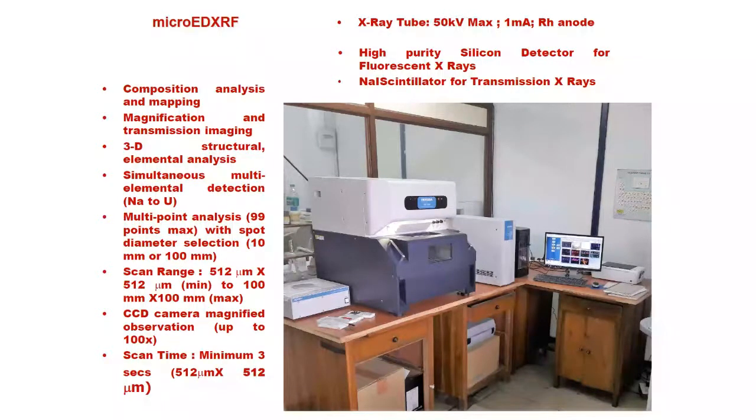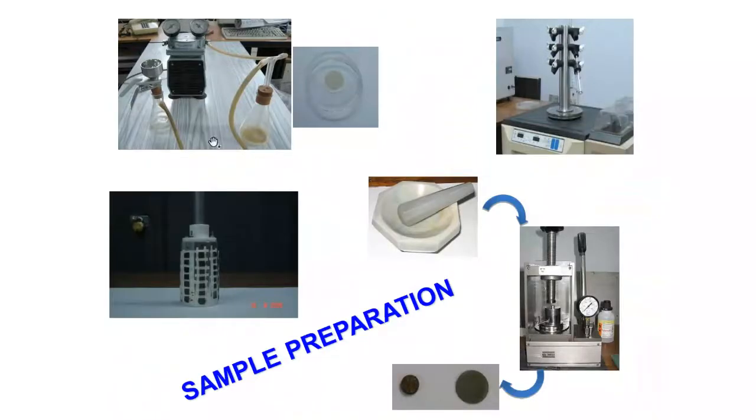So as I said before, before we go and do all these things, you need elaborate, clean sample preparation techniques, which involve freeze drying.